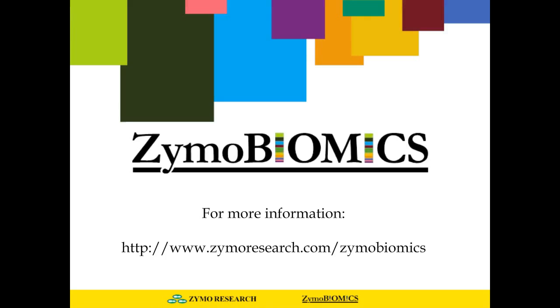Again, these chimeric sequences are totally artificial, and they dramatically increase the alpha diversity of the sample, just like what we see when profiling using our standards. And they will bring a lot of noise to the data, which might bury important discoveries. They need to be removed and taken care of.